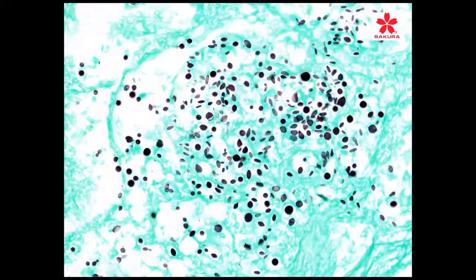Oftentimes this has been misdiagnosed because that lab just saw this and thought, oh, it picked up, so they thought that this was part of the staining, and it wasn't. And so like the next slide that I'm going to show you, this is one of the slides that you graded before. These also are organisms mixed in with some other type of organism, probably red blood cells. But you can see the nature of these. This might be blastomyces or candida. And I believe this is candida.